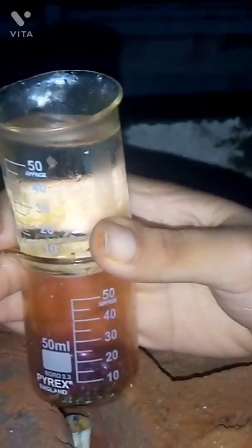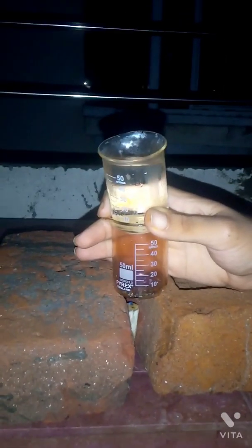So I put this lid there, the lid of a beaker, which will prevent any iodine fumes from escaping. We can cover it with this lid, and wait for a while. Make sure there's no gap inside.